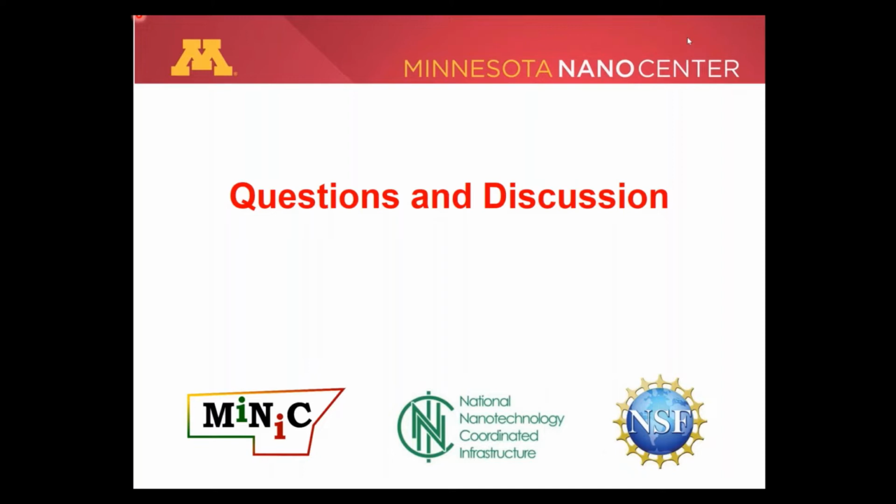Right. Okay, here's one. How about particles which are agglomerates or aggregates? Would they be disrupted in the process? DLS is a very non-intrusive method. It's not going to do much to your particles besides simply collect light scattering off of them. If particles are agglomerating, you're going to measure the agglomerates as well as those unagglomerated fundamental size particles.